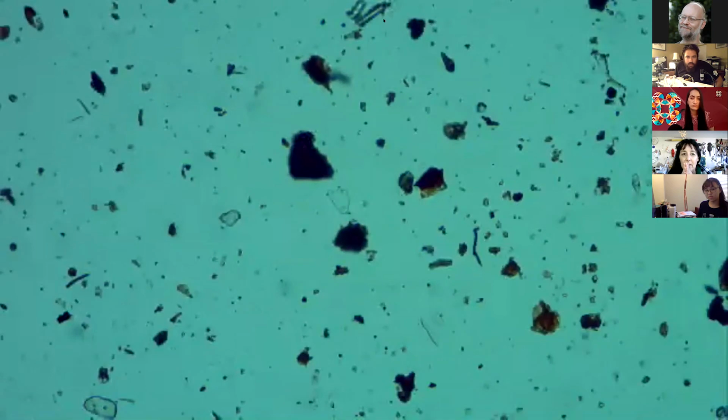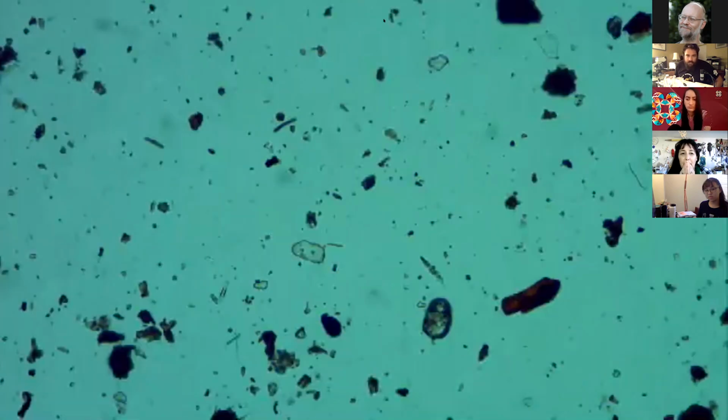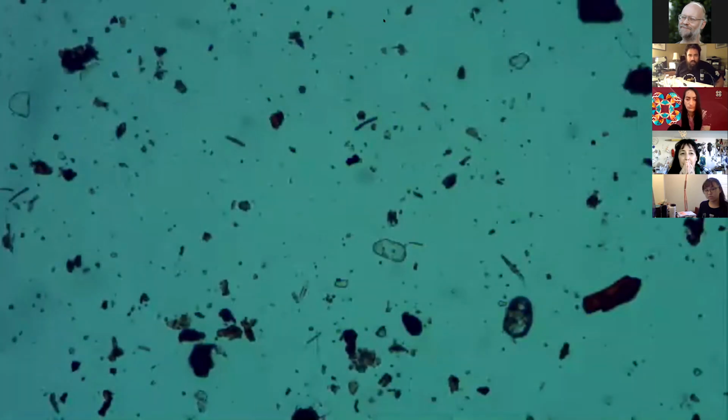All right, so we do have some parent material. Got some chunks of sand in there. So those little dots are sand. And this is kind of disappointing. Aw, a little bit of a bummer.